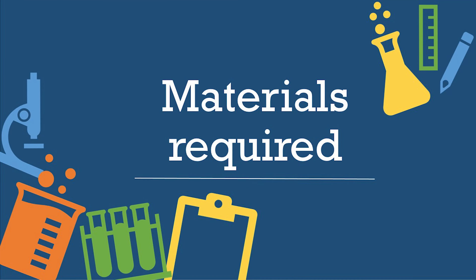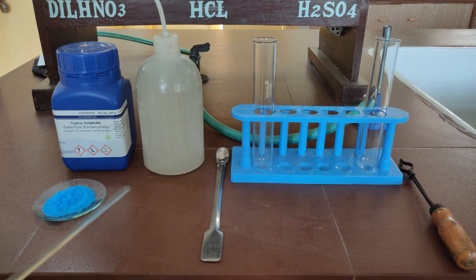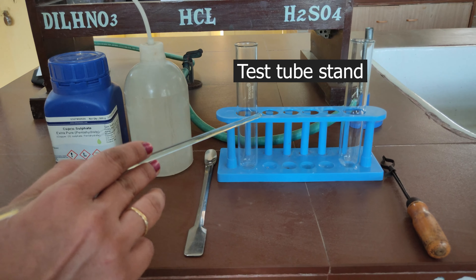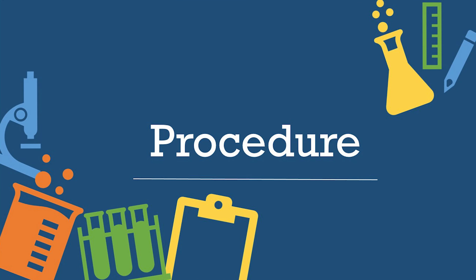The fourth experiment is heating of copper sulphate. Materials required: hydrated copper sulphate crystals, distilled water, spatula, boiling tubes, test tube stand, test tube holder, and Bunsen burner.